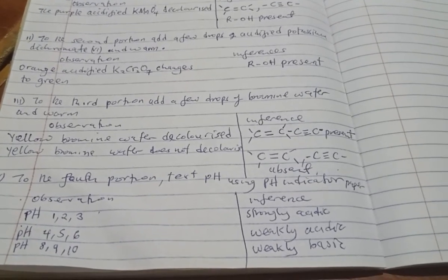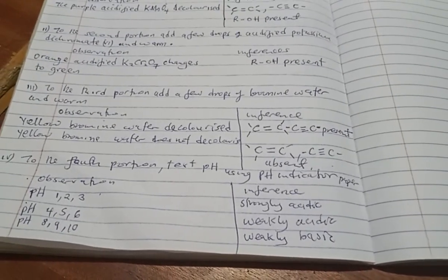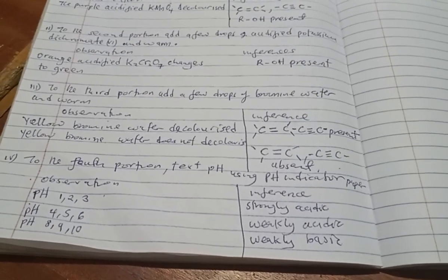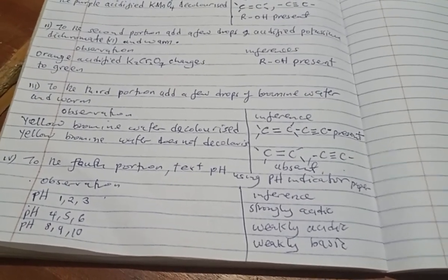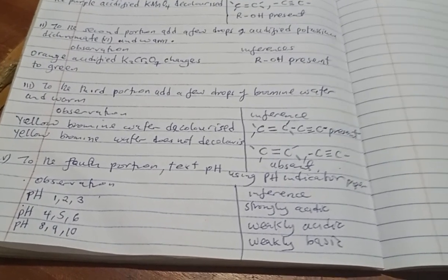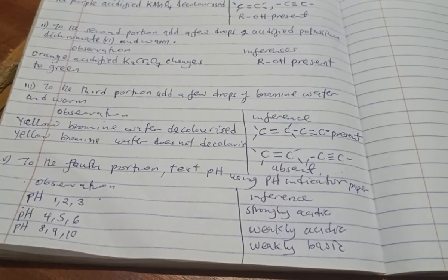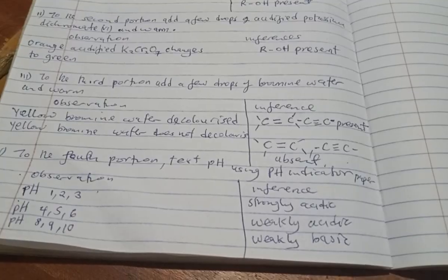To test the next portion using a pH chart indicator. So anytime you are told to test for pH, then you need to give us values. So you need a pH chart where we have values from 1 up to 14. So you normally just give one value. Don't give a range. If it is 1, you just say pH 1. If it is 2, pH 2. If it is 3, pH 3. So if you have seen 1, 2, or 3, then under inference you say strongly acidic.